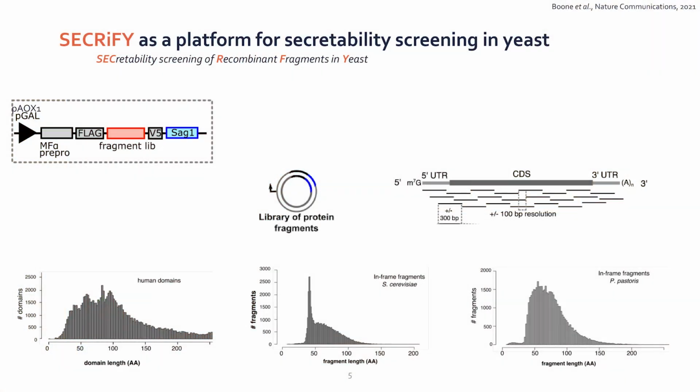Okay, so in our first study that we did with this new technique, we made use of a protein fragment library. We made this choice because we thought that when you're trying to secrete or express a protein, it often fails because of a very small patch or a very small sequence inside your protein. So we really wanted to go to the smallest relevant unit, which we thought was a folding unit, so a domain.